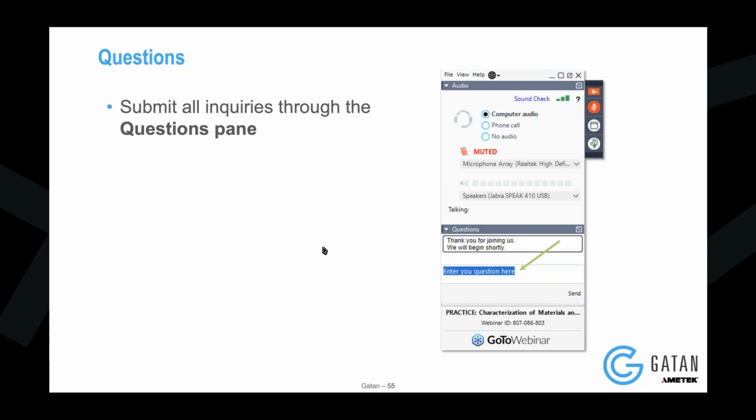Yeah, thanks. So there was a related question that came up of, do you think the K3 acquisition speed is required to be able to do these kinds of experiments? You kind of maybe just mentioned a little bit about that. Or another related question might be, what's the acquisition speed you ideally would like to have, you think, to be able to resolve these dynamics in these domain walls?